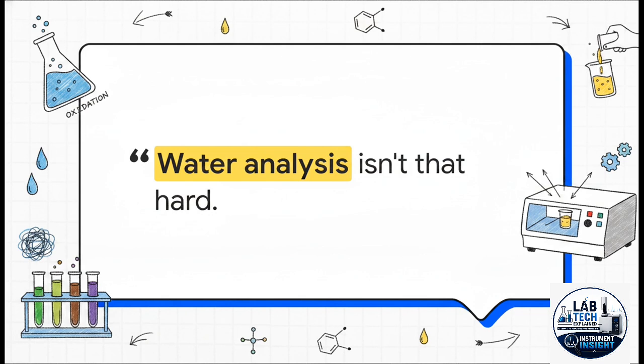Now, this test is a real game changer. It literally tells us how polluted a sample is by measuring everything inside it that can be oxidized, organic or inorganic. It is absolutely vital for wastewater testing. But as Matthias reassures us with a smile at the end of his demo, water analysis isn't that hard. Well, as long as you have the right tools and follow the proper structure.